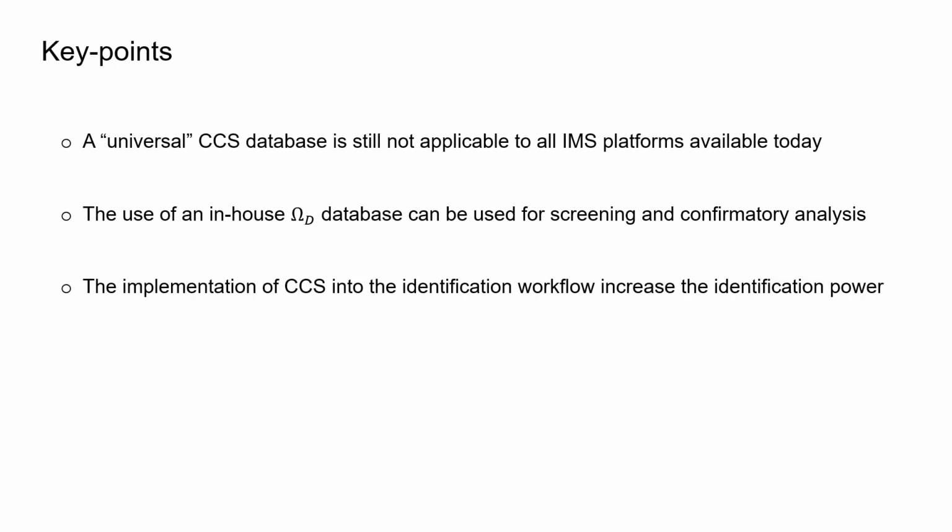And the use of the CCS is with no doubt advantageous if implemented in the identification workflow with the retention time and accurate mass of precursor and fragment ions, as it helps decrease the number of false negatives and false positives.